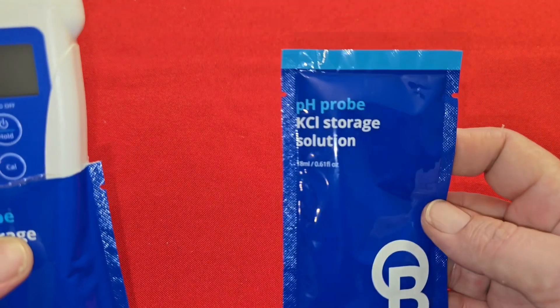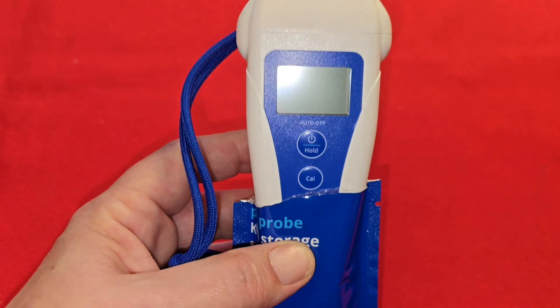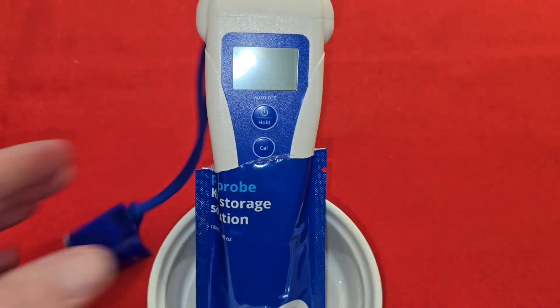If your probe is brand new, you're going to want to soak it for 24 hours in KCl storage solution. Just open the satchel and put the meter in the satchel.